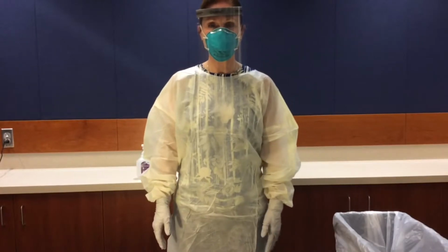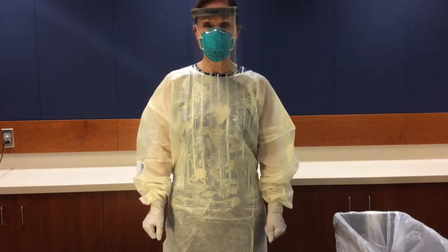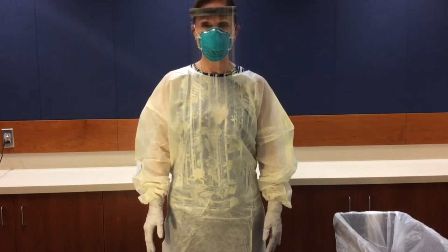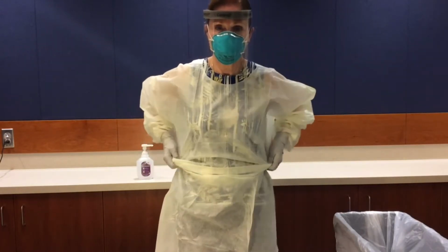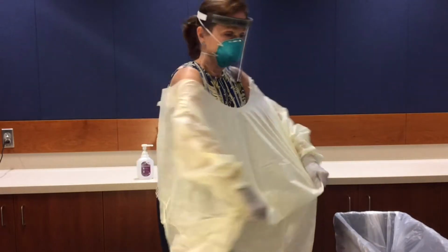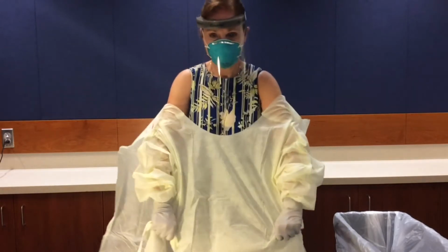Gown and gloves are the first items of PPE to be removed. At MGH, the one-step method of removing disposable gown and gloves together is used. This is accomplished by grabbing the gown materials at both sides of your waist and then pulling forward, which will cause the ties to break. Continue pulling forward, which will cause the back of the gown to tear away.